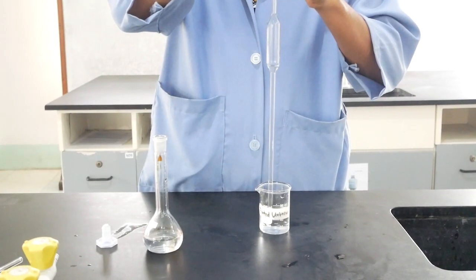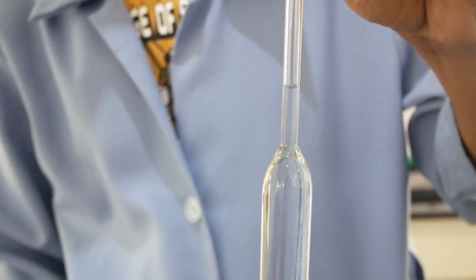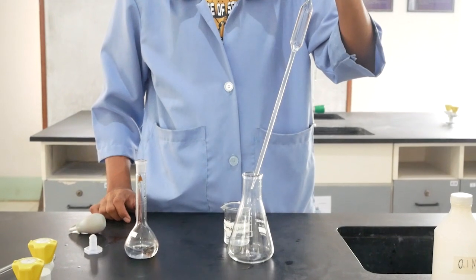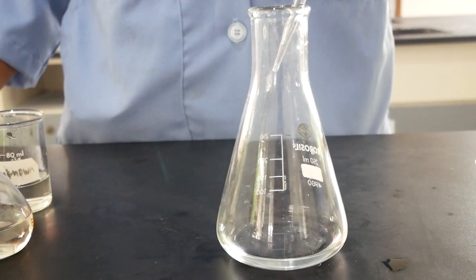Then pipette exactly 25 ml of this diluted hydrochloric acid solution into an Erlenmeyer flask, which we will use to titrate the solution. This is now the analyte.